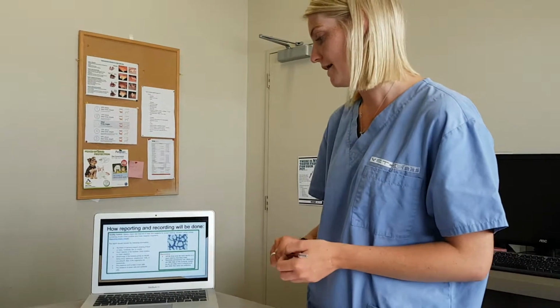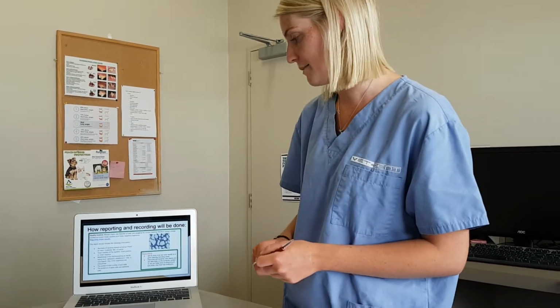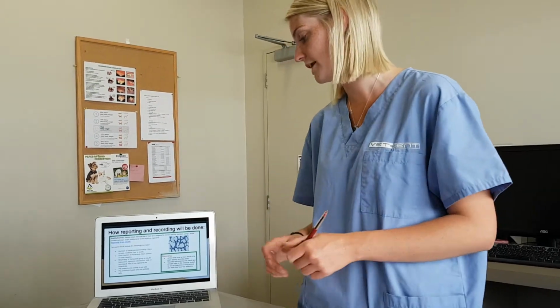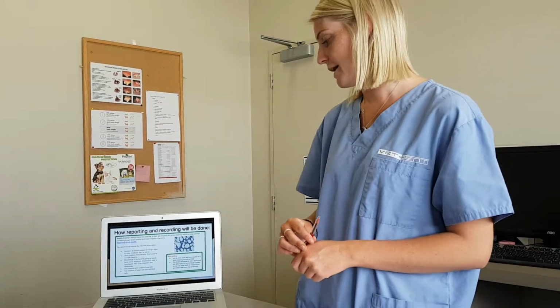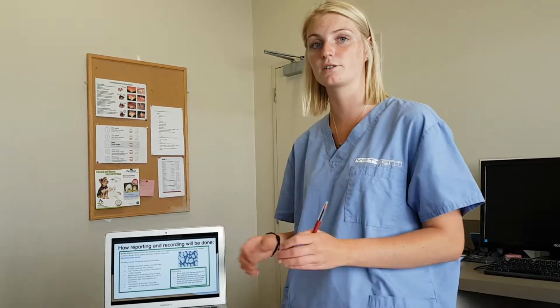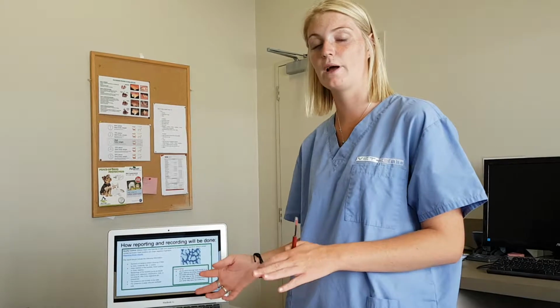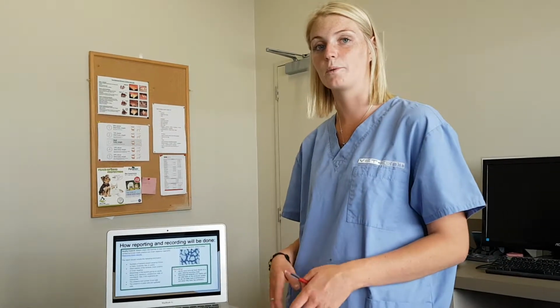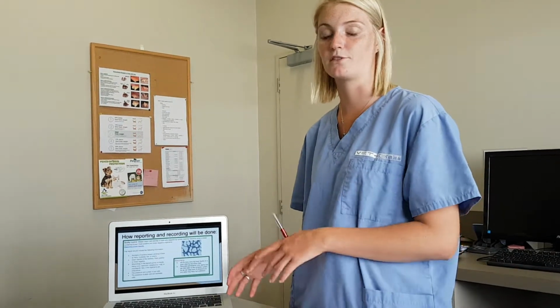And also the numbers, yeah, so we've gone over that. And then recording again would just be recording onto the piece of paper and then putting it into the client's documents on computer, so that if need be, we can go back and look at them and discuss with the client what we've seen and what we've found and what we think treatment from there could be.